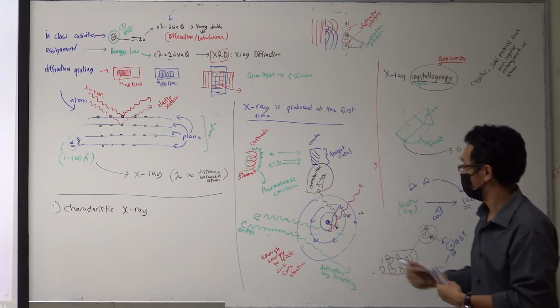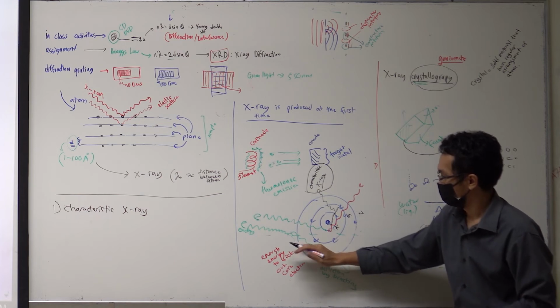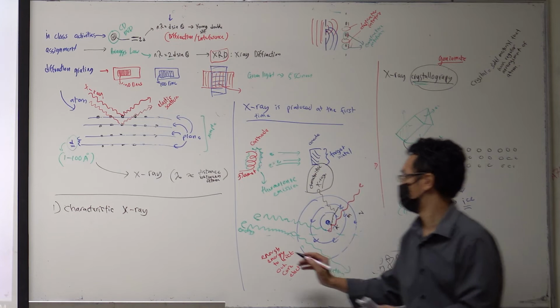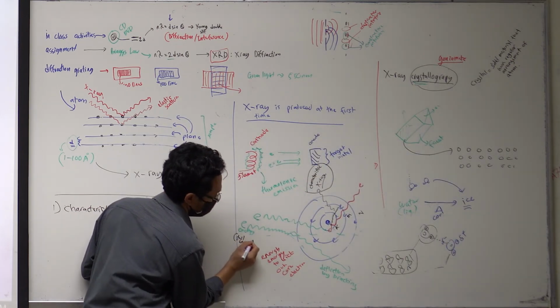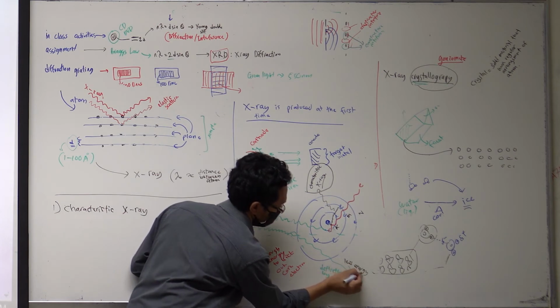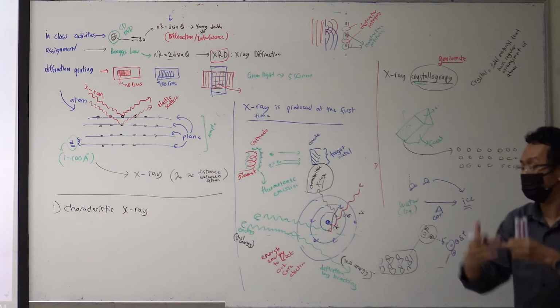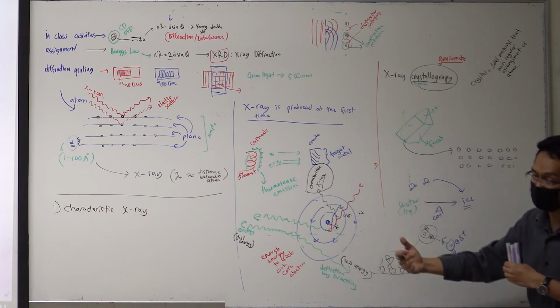Let's say I put full energy here, and this is less energy. Because of the difference in kinetic energy, it gives another X-ray.